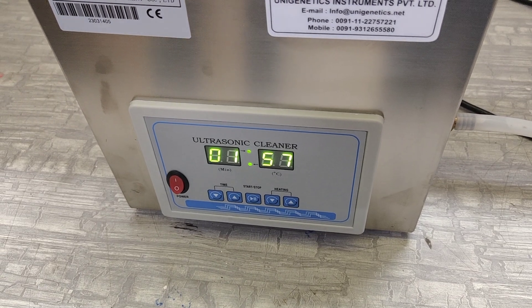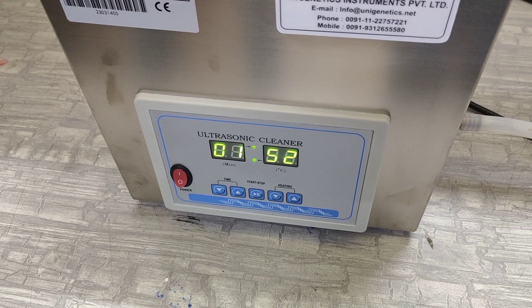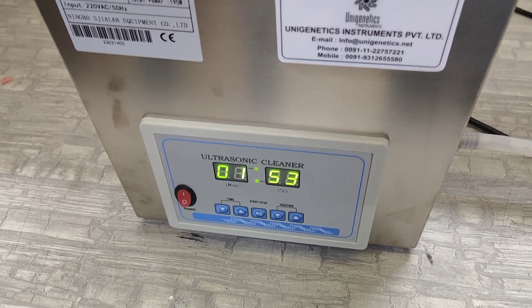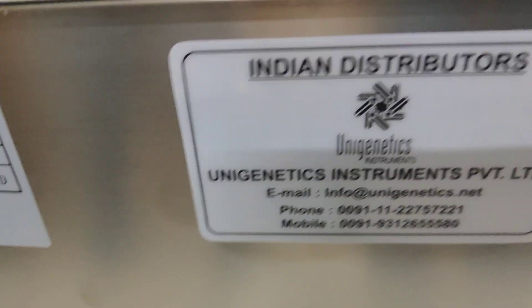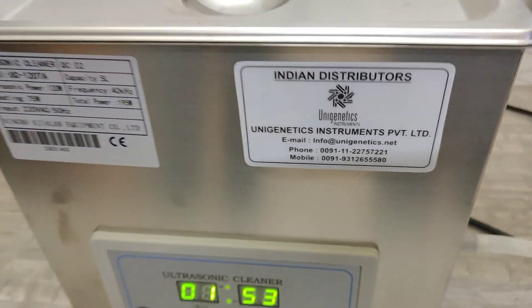Once the one minute is over, the machine will stop. As mentioned, this is a very simple machine, and still if you have any query or require any service, you can always come back and we will help you.